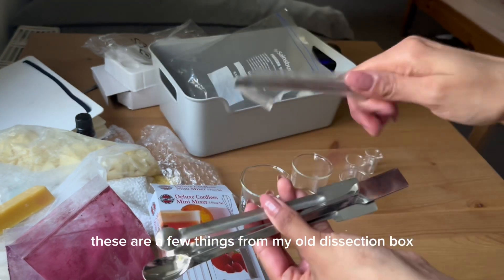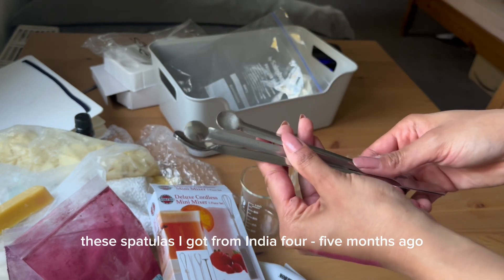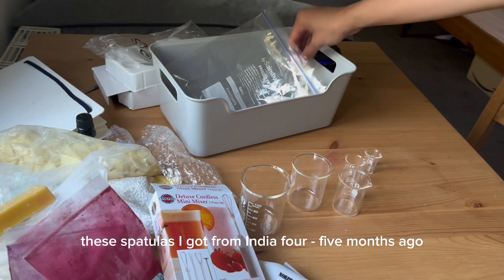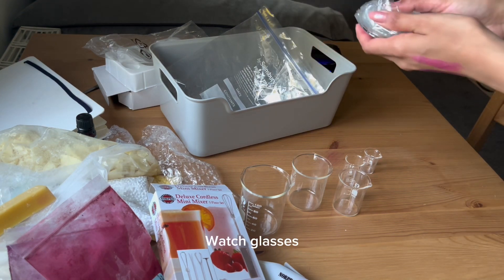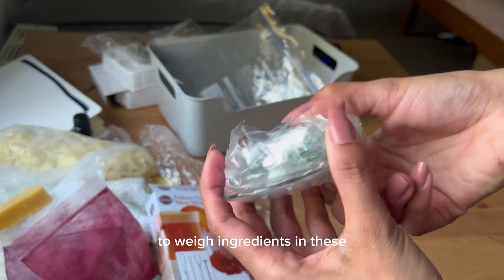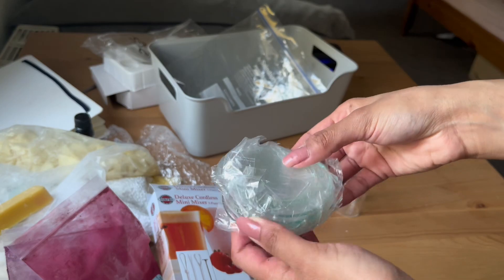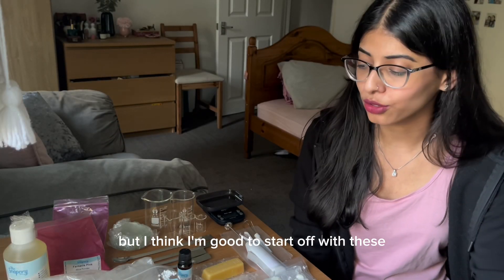I also got spatulas, and these are a few things from my old dissection box that I thought I might need. These spatulas I got from India five months ago when I went there — quite affordable. I also got a bunch of watch glasses to weigh ingredients in. These are also from India.